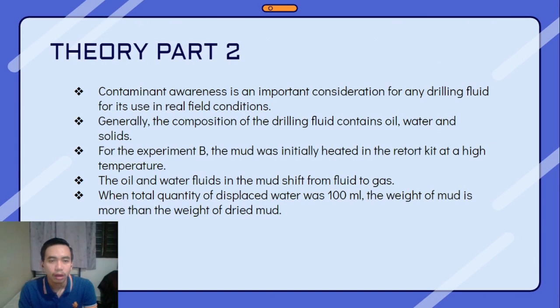Contaminant awareness is an important consideration for any drilling fluid for its use in real field conditions. Generally, the composition of the drilling fluid contains oil, water, and solids. For experiment B, the mud was initially heated in the retort kit at a high temperature.